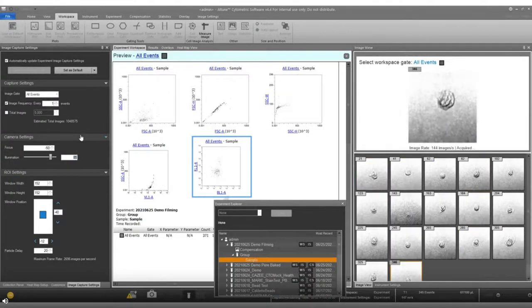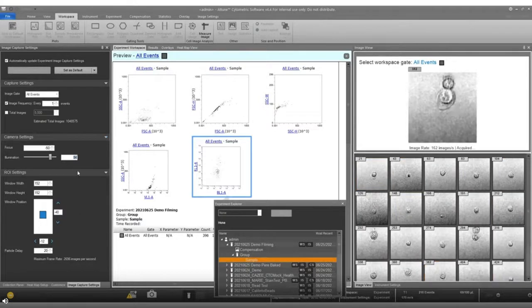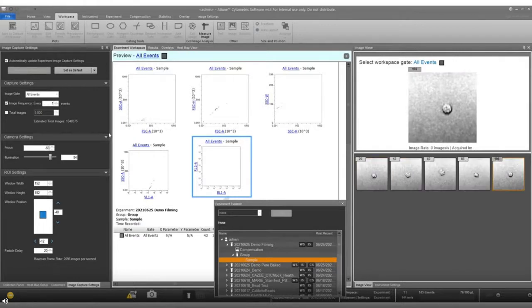Okay, there we go again. I forgot momentarily where our range was. I inverted our numbers here, went from 84 to 48 instead. But we are back in action. It goes that quickly. It is really that fast after you use the system a few times to find a nice focal plane that you like and a nice imaging area that you like as well.